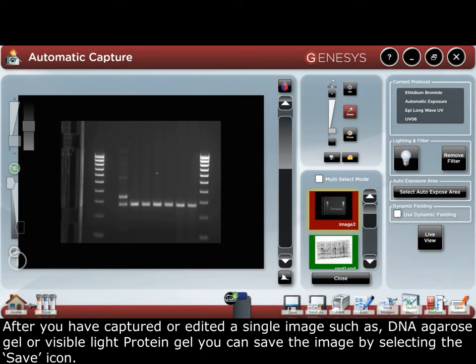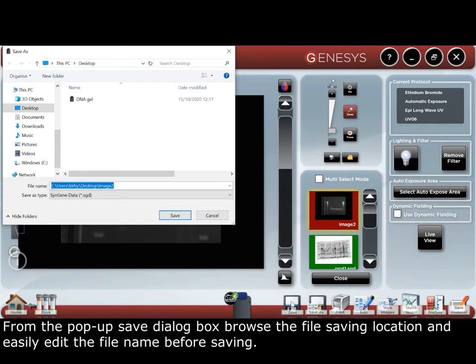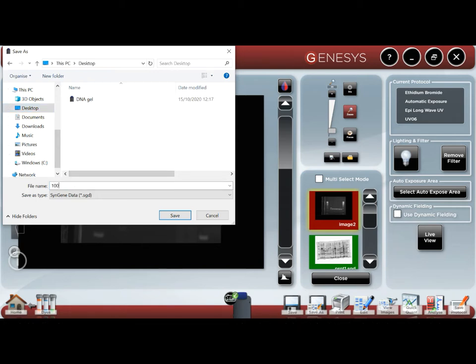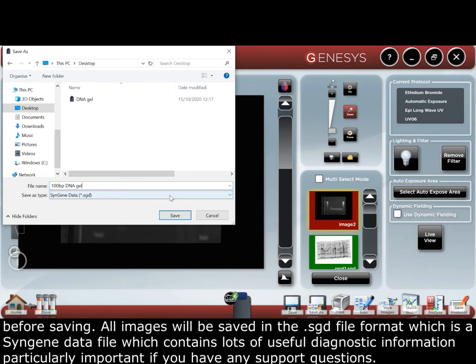After you have captured or edited a single image such as a DNA agarose gel or a visible light protein gel, you can save the image by selecting the save icon. From the pop-up save dialog box, browse the file saving location, and easily edit the file name before saving.